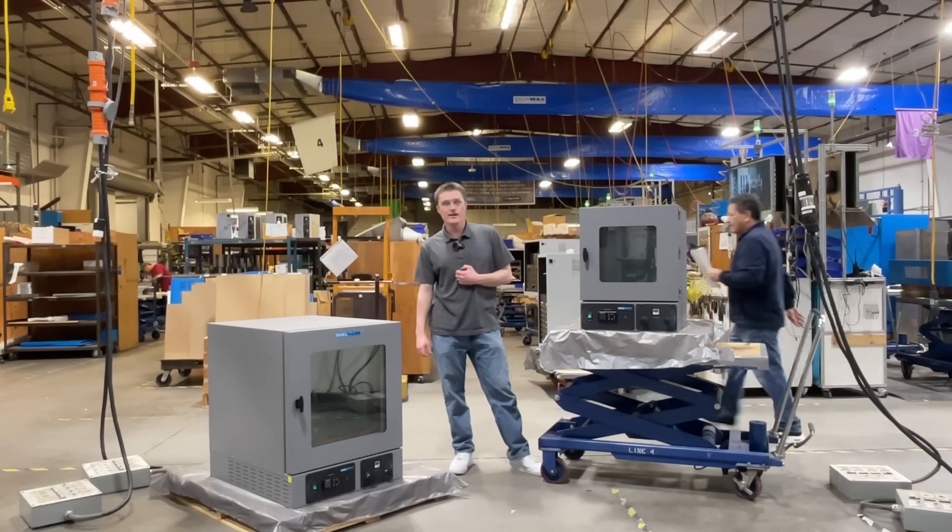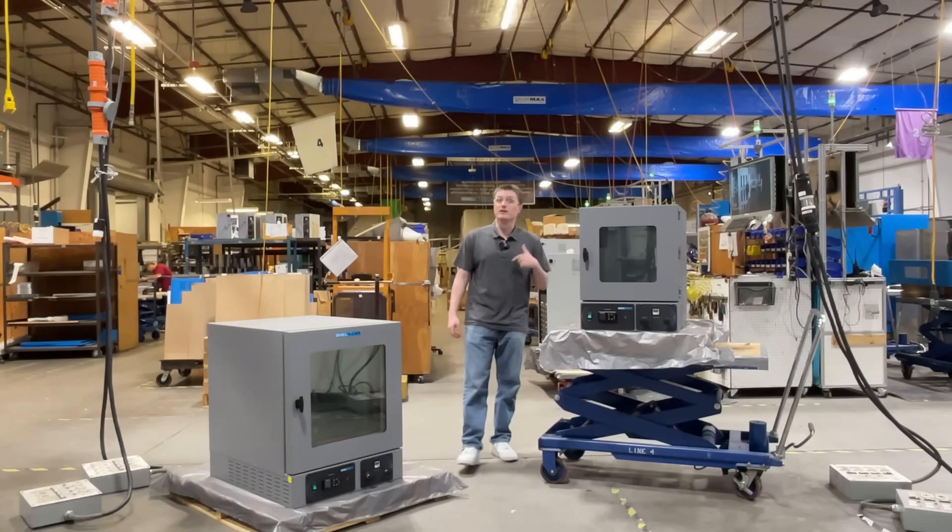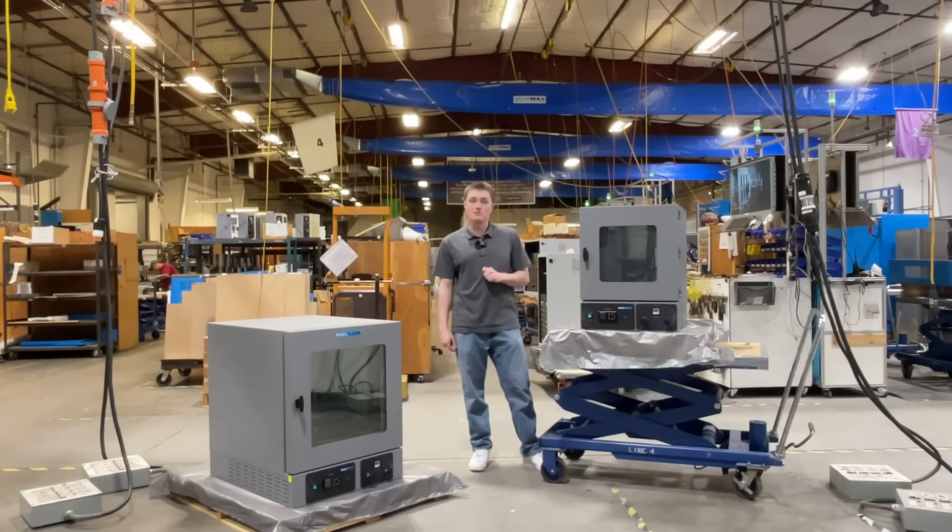Hello again. My name is Kord Sanksteek. I'm a design engineer here at Shelton Manufacturing. Today, I'm going to be introducing Shell Labs' SVAC series of vacuum ovens.